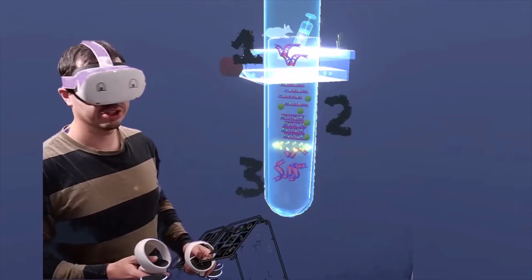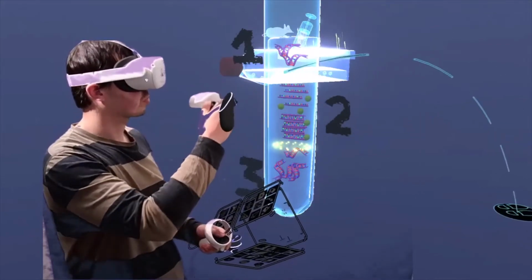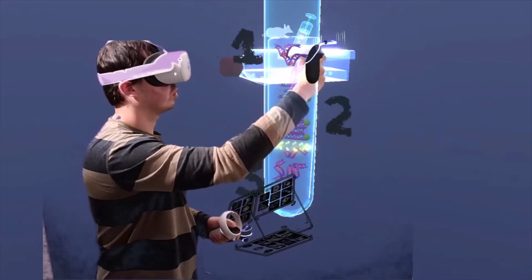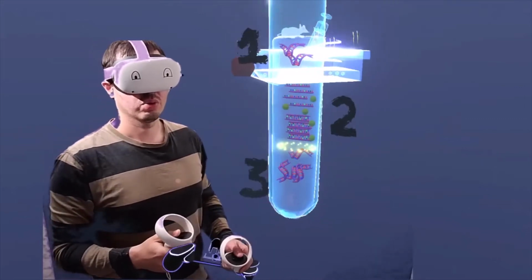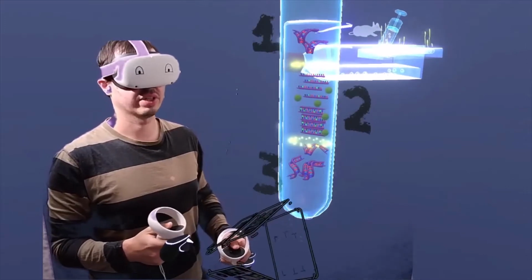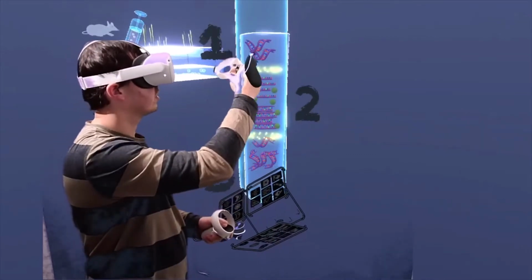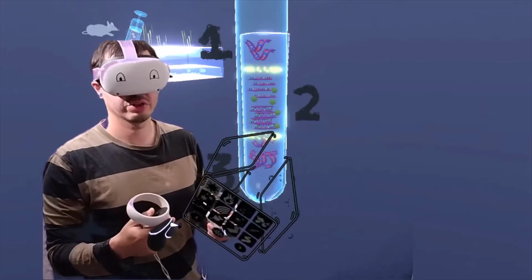To do that, I'm going to use a molecular technique called polymerase chain reaction, very famous, which has evolved a great deal in the last few years, and which is an iteration of these 3 steps. First of all, the medium is going to be heated. You have your DNA here, you have 1 and 2 genes, and what you want to do is to separate the DNA strands. There. So you have 1, 2, 3, 4 strands, which are held together by hydrogen bonds.